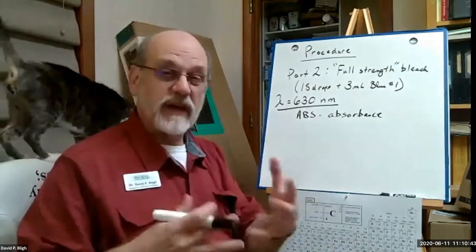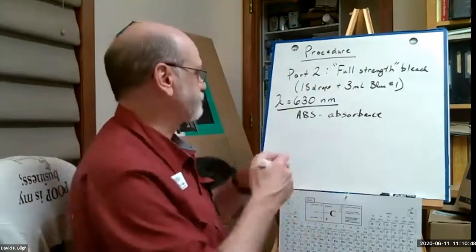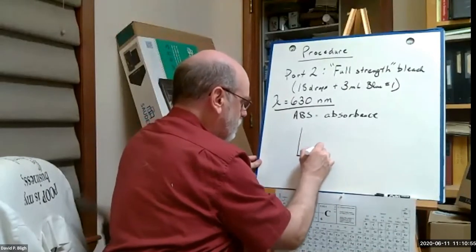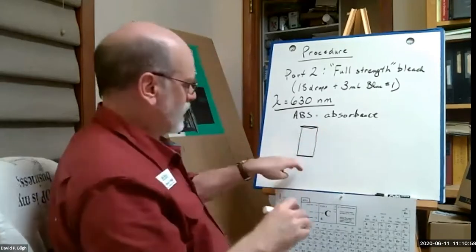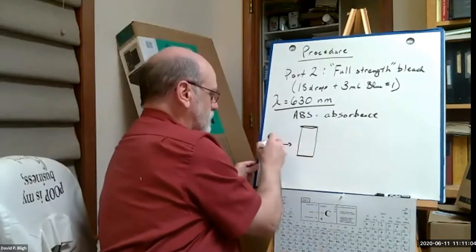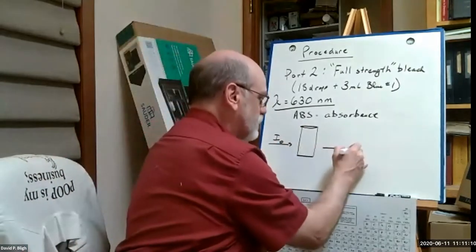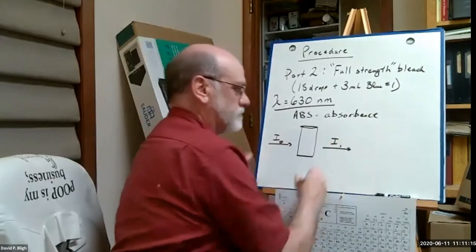So how do you actually conduct the experiment and gather the data? This is where the data comes from. You have your cuvette, and the light is going to be traveling, the way Kahn put it, the incident radiation, and then it's going to produce some output here.